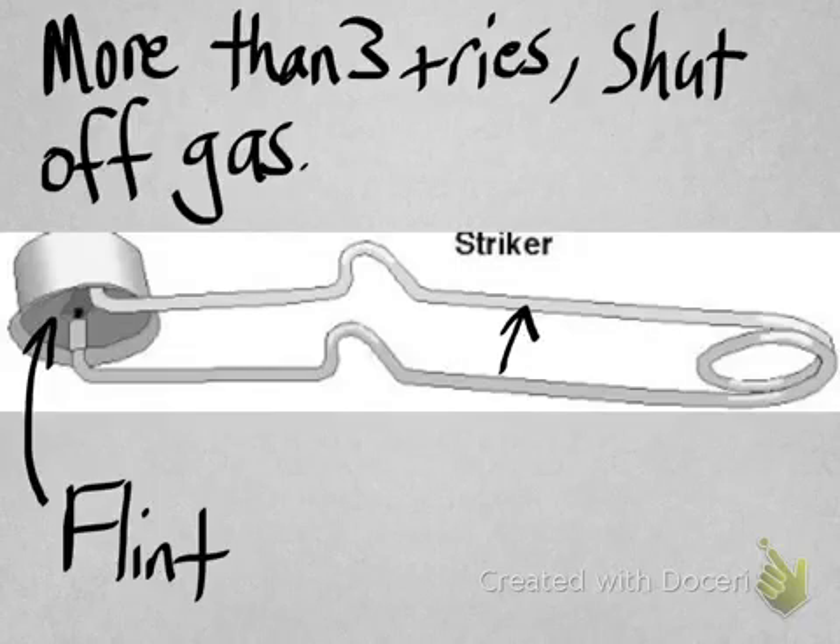The reason for this is that gas will build up as you're trying to use the striker, and when you finally get a spark, all the gas that's been let out will ignite, creating a huge ball of fire. It sounds fun, but it's not so fun when it's your hand or your eyebrow that's in the way.